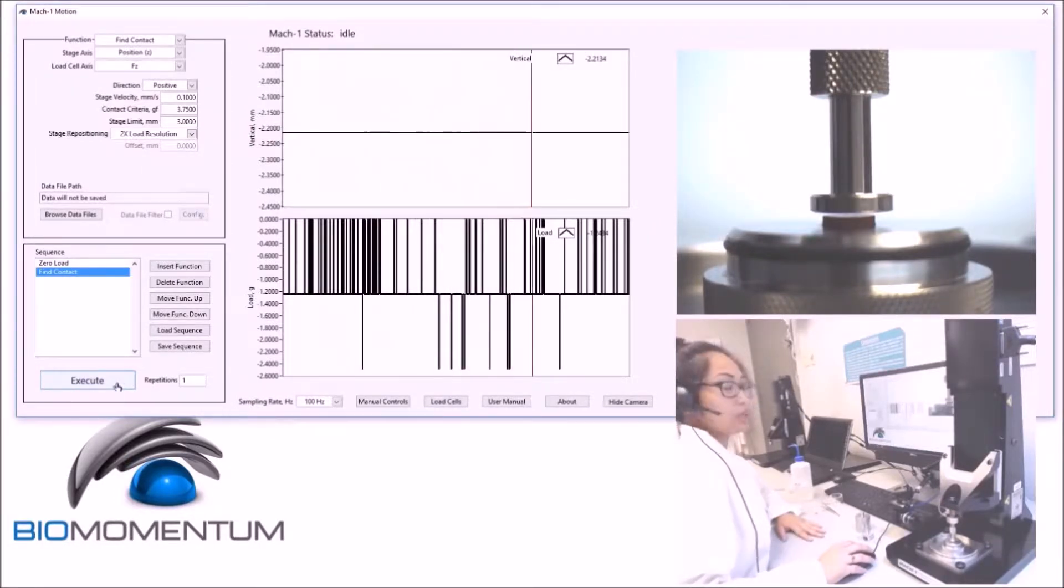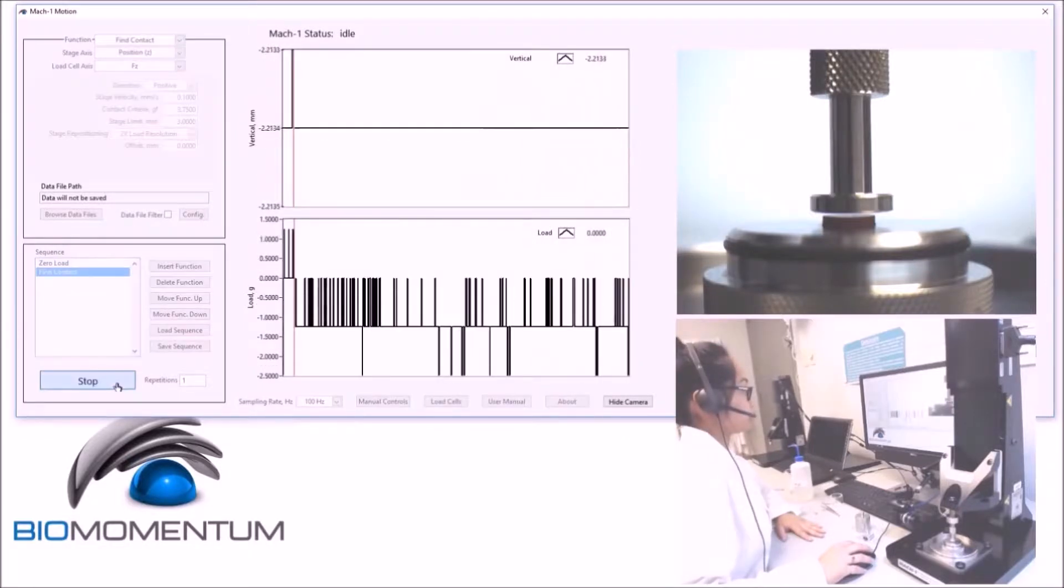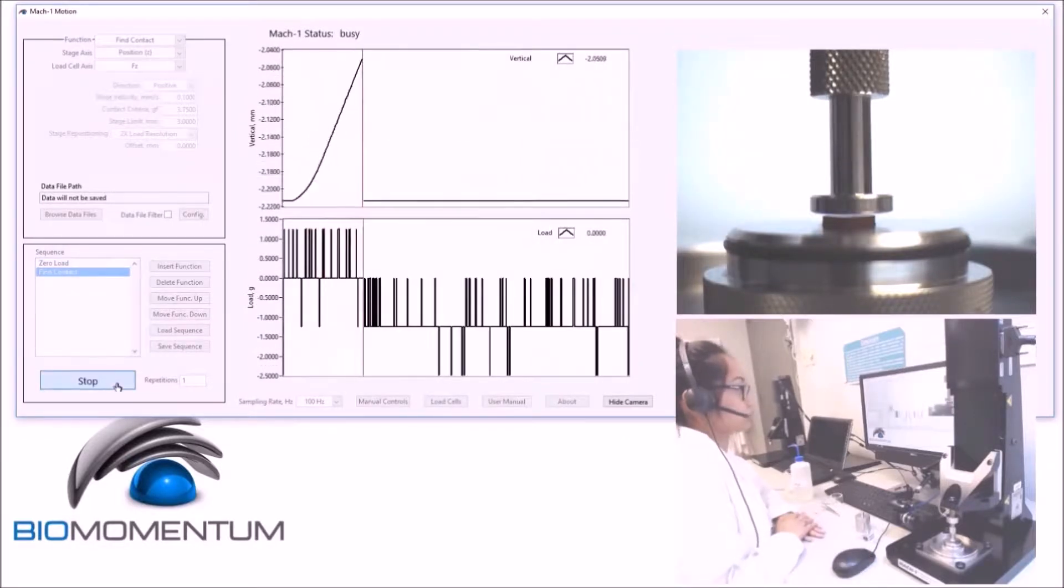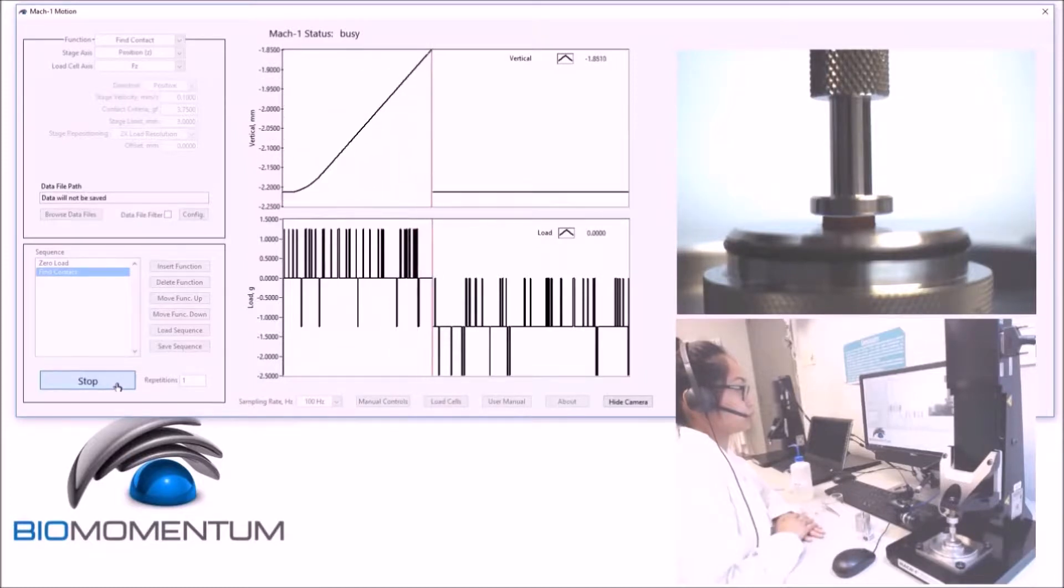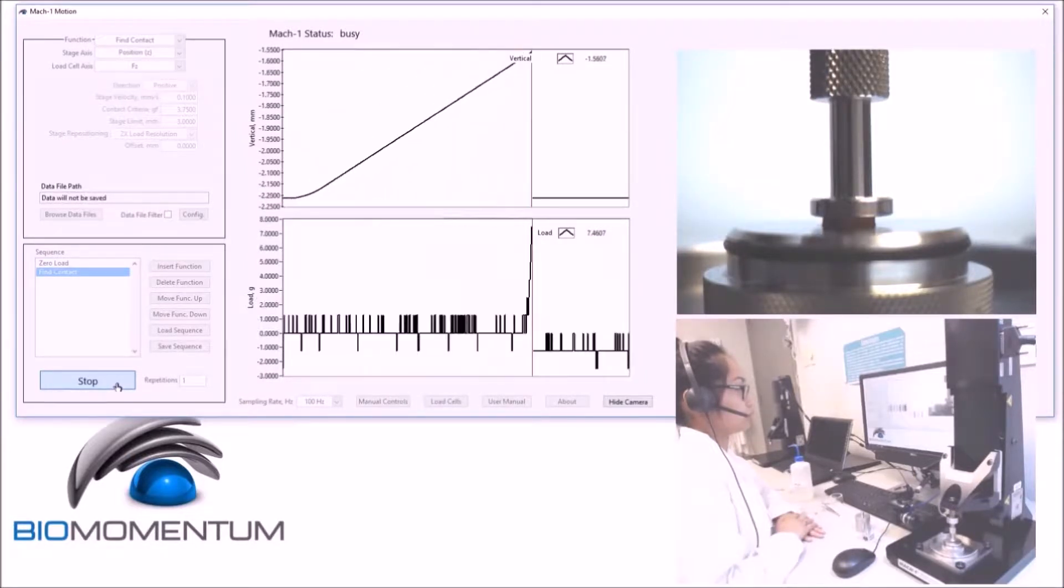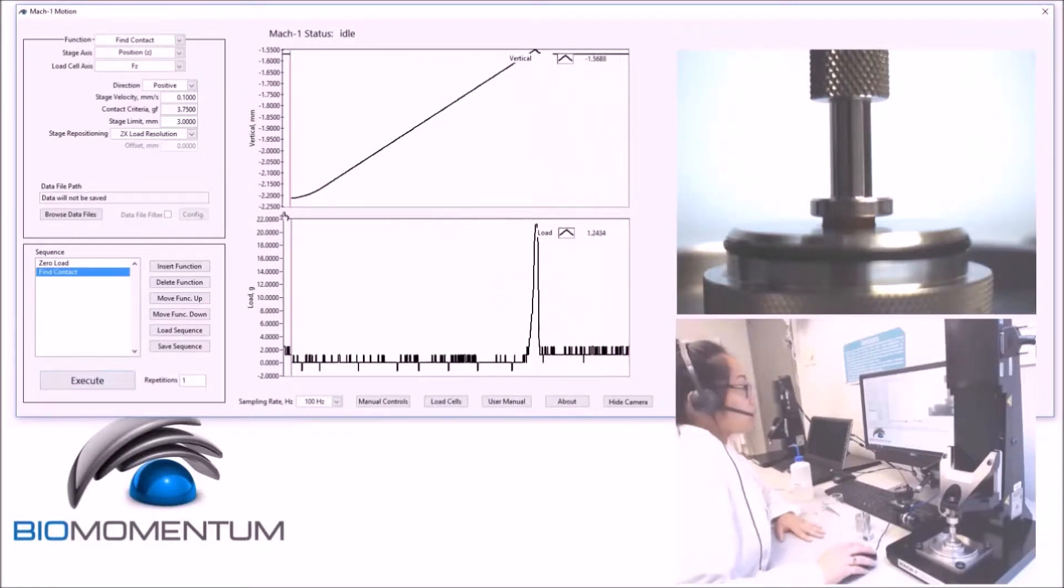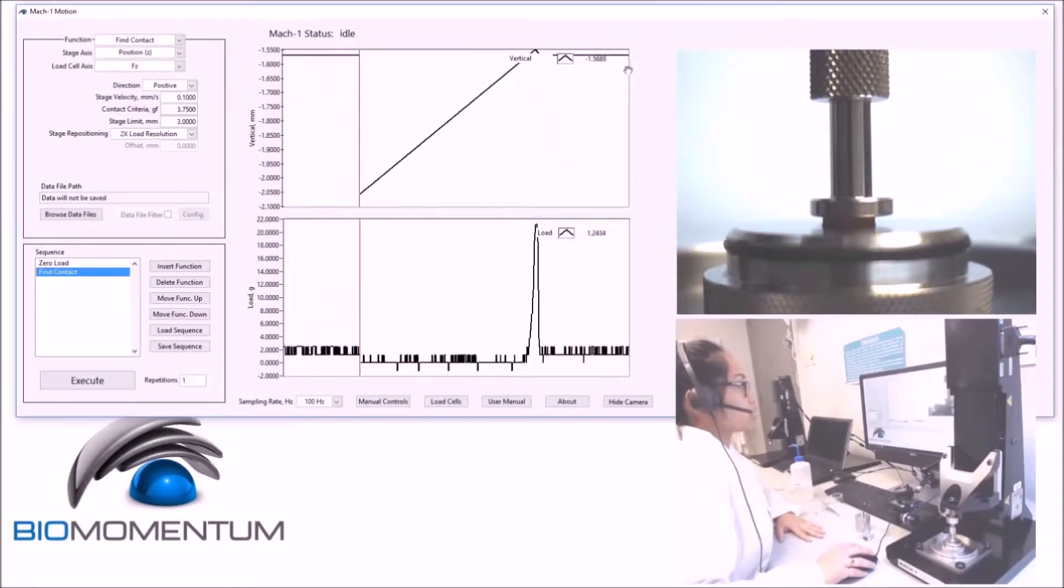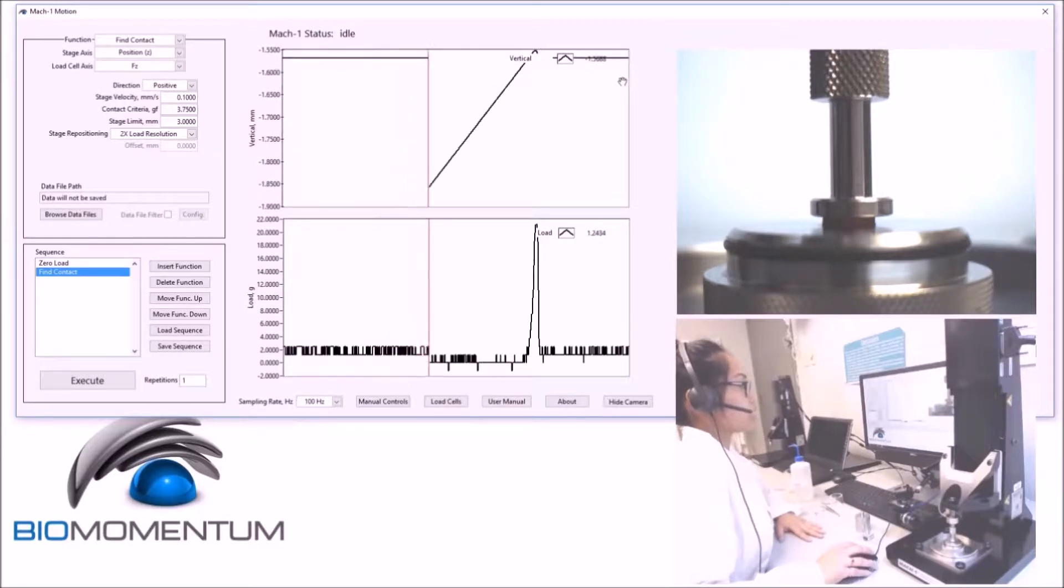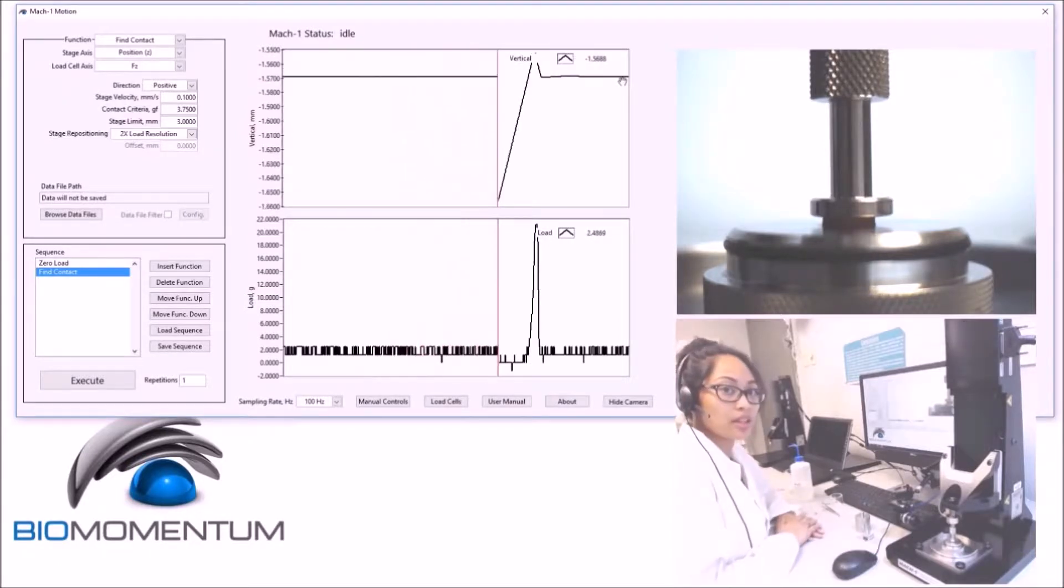You can now press Execute. Report the current position of the vertical stage as the rubber disc thickness.